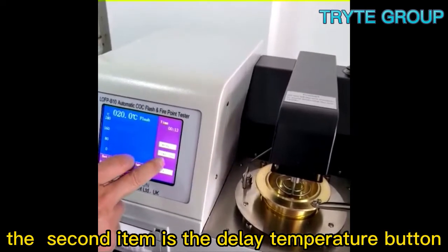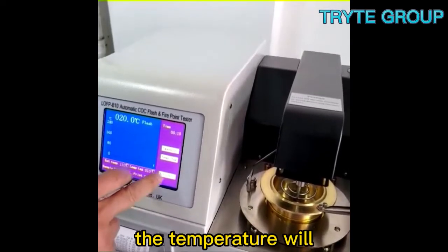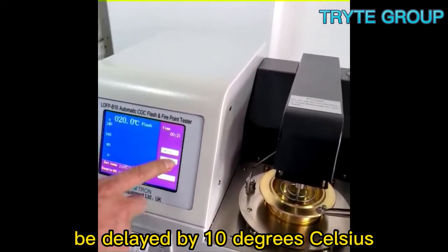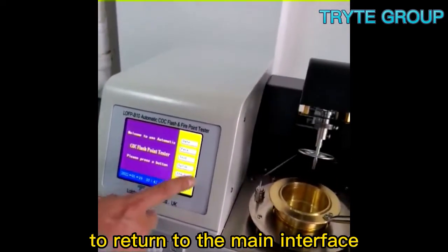The second item is the delay temperature button. Each time you press it, the temperature will be delayed by 10 degrees Celsius. Click the return button to return to the main interface.